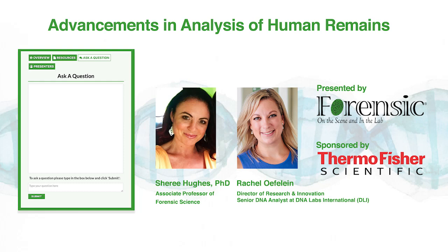Those are samples that we would even consider going forward with rapid on. Other samples, though, say it's been in water for years and years and years, I've actually also had really good luck with those as well, as long as it's salt water. Where things have been a little trickier is if it's in, say, a really acidic bog or something like that, where it's going to be harsher conditions. In those cases, I would not attempt the rapid at all, and I would go straight forward with demineralization and organic.